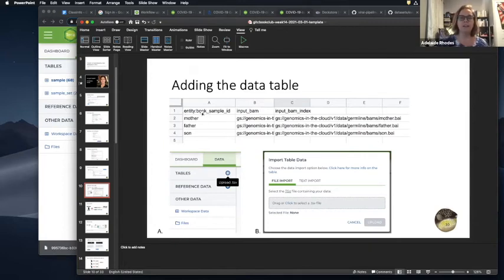the Terra platform is looking for certain information, such as this first column here where it says entity: you have to have that. So that's something that's unique to Terra, so that it can know what type of thing you're looking for. Because then if you have nested workflows, certain types of entities are recognized as being nested inside other types of entities, if that makes sense.